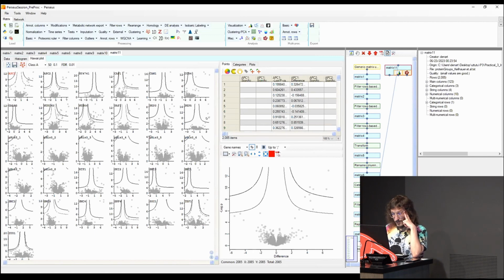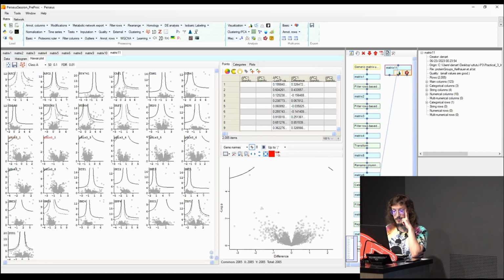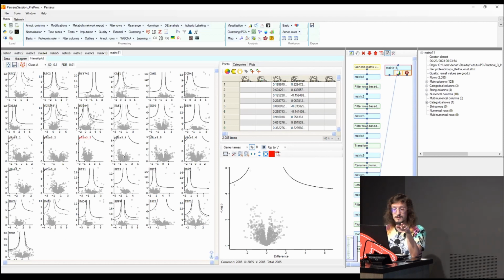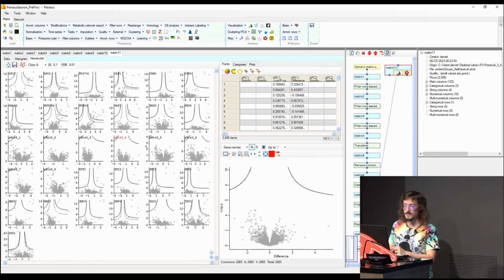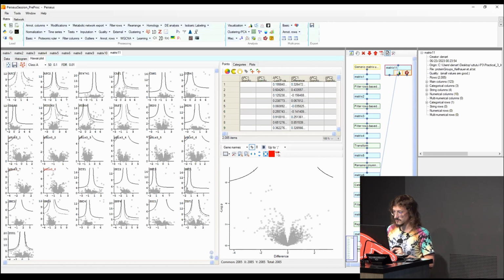Something that I would like to point out that I think is nice because it shows that's exactly what we are expecting. We don't have any significant proteins for histones. Well, because we were not expecting for this specific condition to see any complexes. And that is good. It means that we are having a good experiment here. And all of the replicates with histones don't have any significant protein. Only those for different baits show some significance.